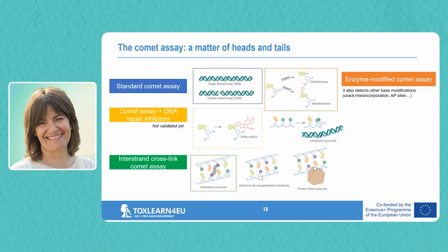Do you understand? Okay. And then there are other versions to detect global methylation, which is an epigenetic event. It has not been validated either, but it works. And then DNA repair: you can measure DNA repair with the Comet Assay. This is something Sabine Lange will talk about tomorrow.